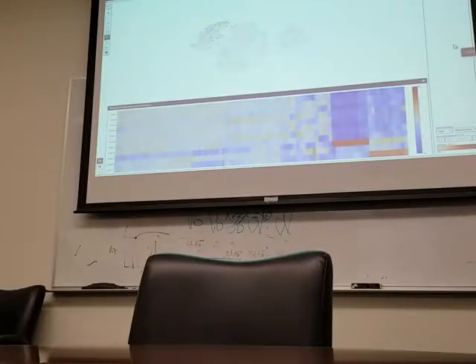And with t-SNE it doesn't matter anyway, because the B cells will group together, and any particular B cell marker we know is definitely on the B cell is not necessarily expressed at the gene level. So we understand completely, and we're not even interested in it. If I were interested in mRNA half-lives, I would study this. But you can't use one gene that you know is on a B cell to pull out the B cells.